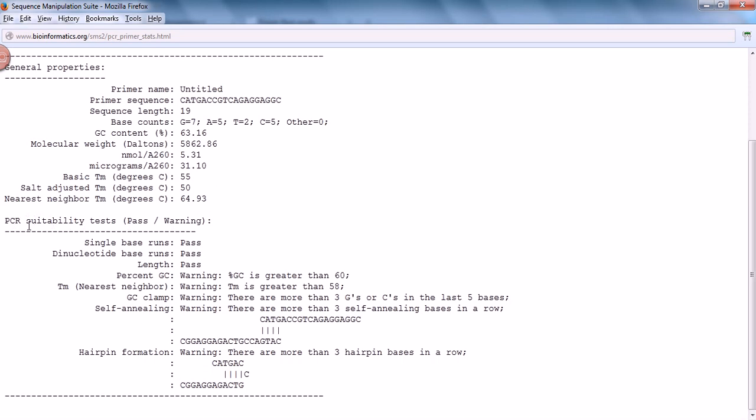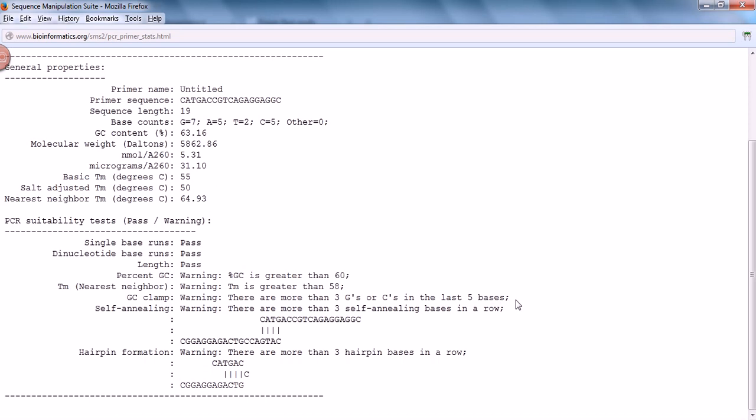What we are most interested in is the PCR suitability test - whether they pass or got some warning. In this case, among six or seven different parameters, they pass only three. Four have warnings. One warning is that GC is greater than 60%. The warning is melting temperature is greater than 58, which is not actually good for running them in in vitro conditions. The warning is that there are more than two Gs or Cs in the last five bases.